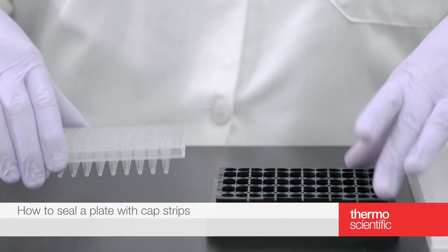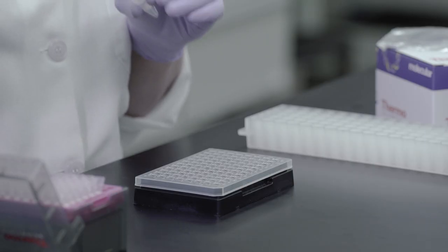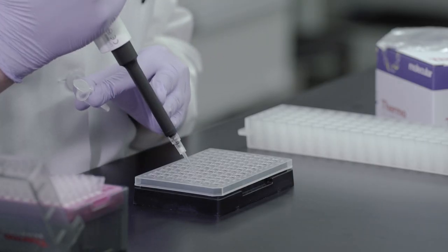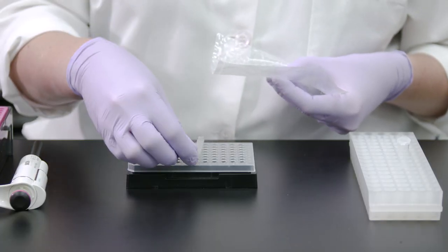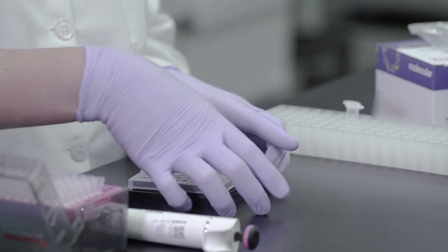To seal your plate using cap strips, first place your plate securely in the PCR plate rack. After pipetting your PCR samples into each well, remove the cap strip from the packaging and align the cap strip to the designated wells.